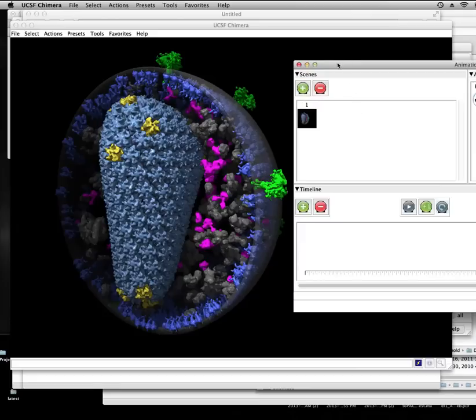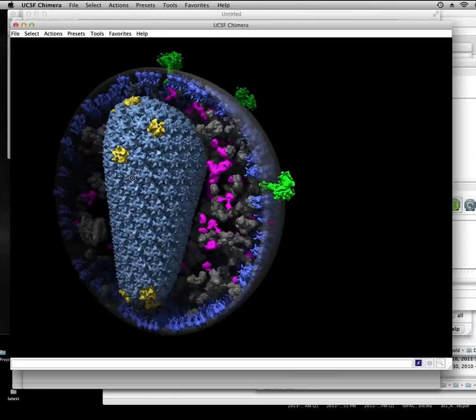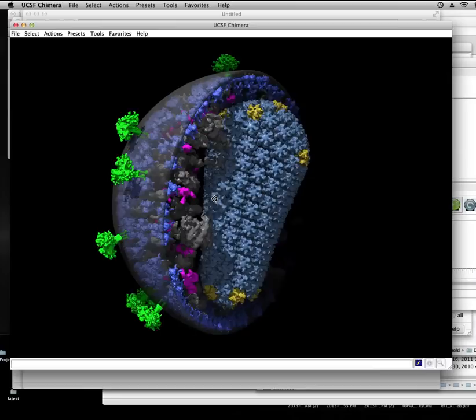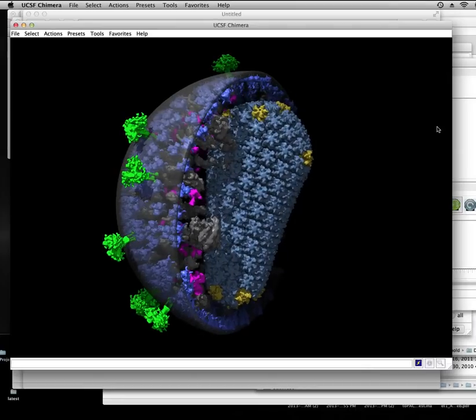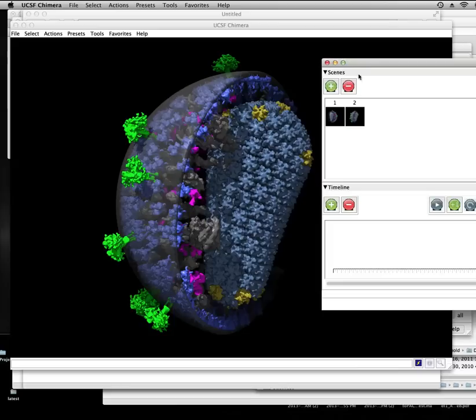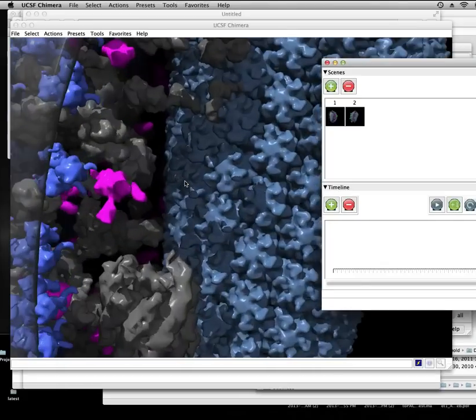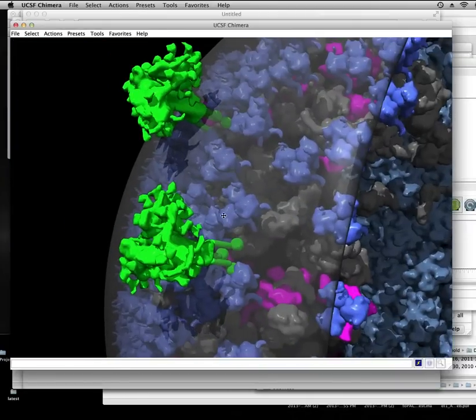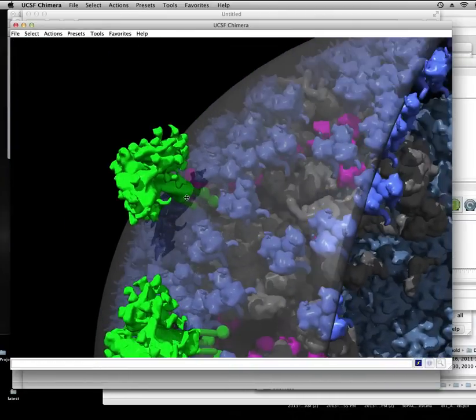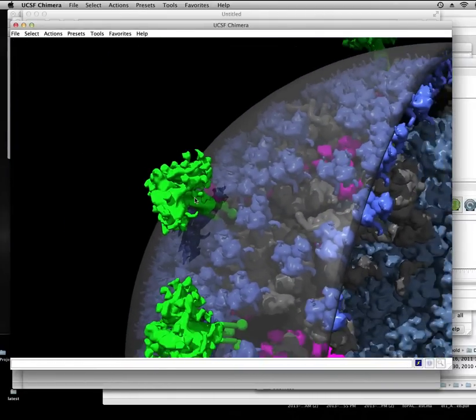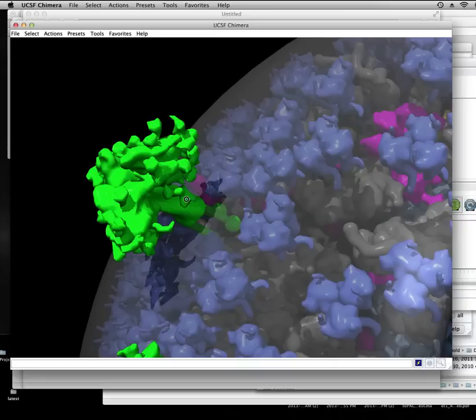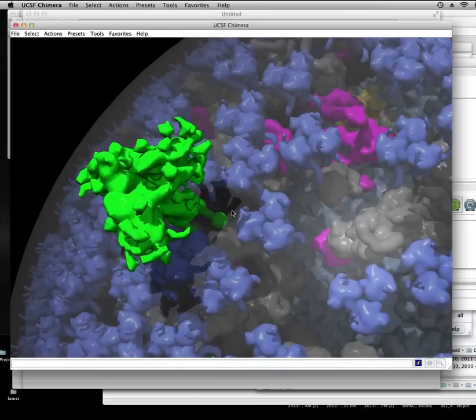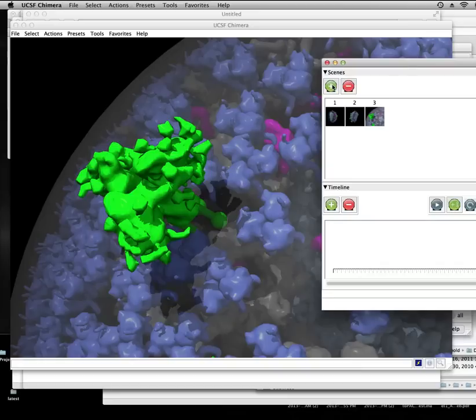And then we'll make a change. So let's do a rotation. We'll add another scene grab there. And then let's do a zoom into this spike.